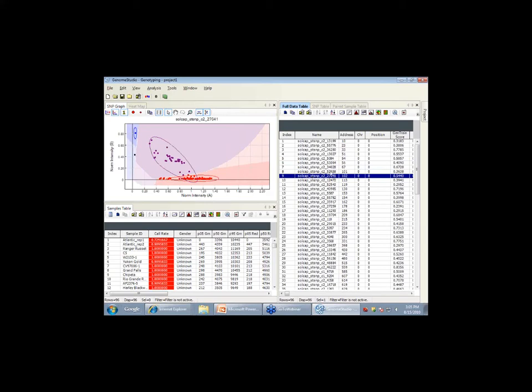Actually, number 9 is not that bad. I'll give you an example. The best way to figure out good from bad, and this is kind of the next thing: if you click on GenTrain score under the full table view, you now have sort tools. Why don't we sort from top to bottom? The GenTrain score is the confidence it has in calling all the data for that particular SNP.